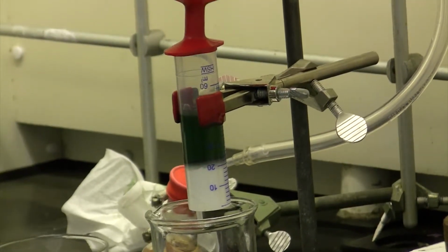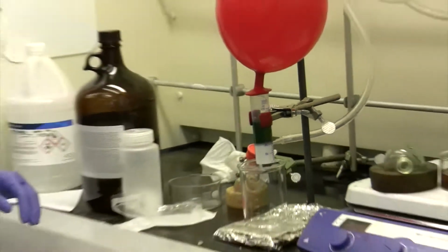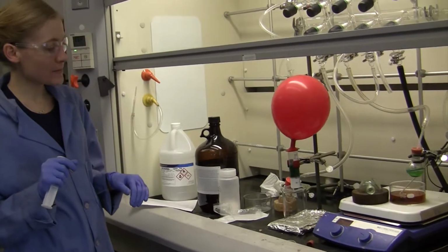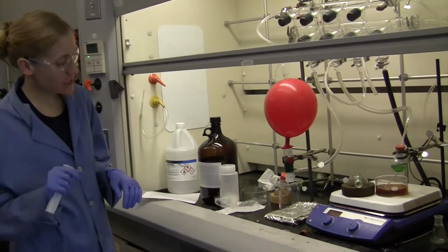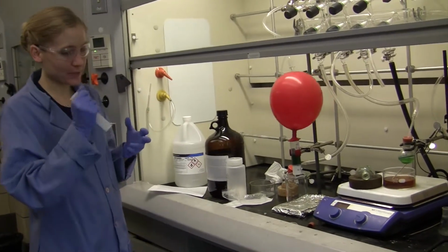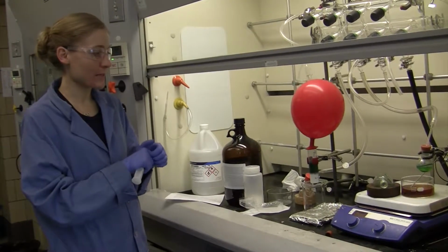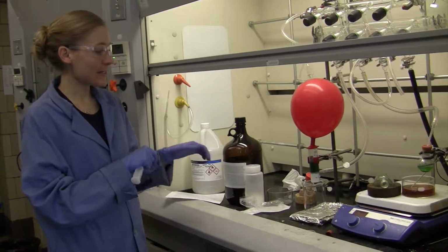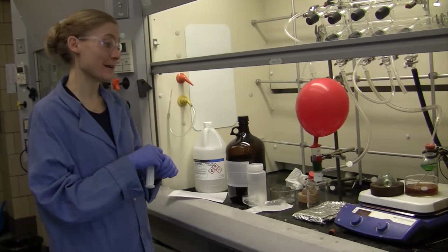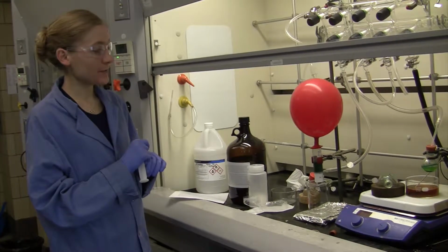Like I said, this will help it along. You can also use a plunger to push it through. That can be tricky though. I like speed, but with all the negative pressure and the pressure buildup with the plunger that you put on, it can be a little bit risky. You can mess up your column. So I think this is a little bit safer. You can also just wait for gravity, but it will take a very long time. You probably want to just let it go overnight.